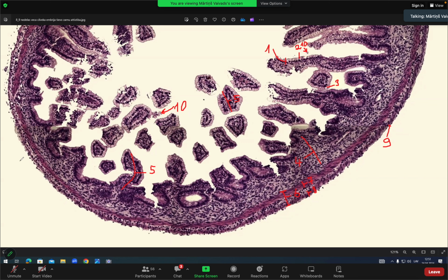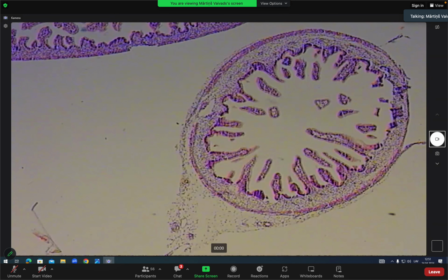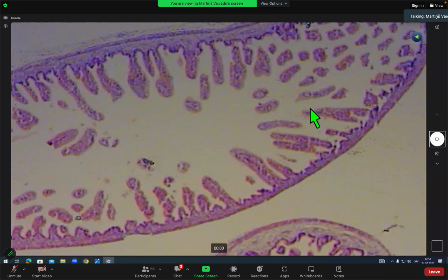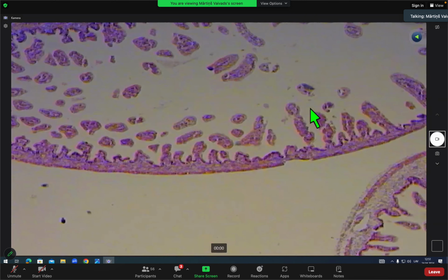I will very briefly show you the microscope. I won't go through all the structures because it's very similar to the slides that are in studies, but some specific details. So, for example, here, small intestine development, you might see different sections. In the microscope, you might see longitudinal sections, also much larger sections of the intestine can appear here.